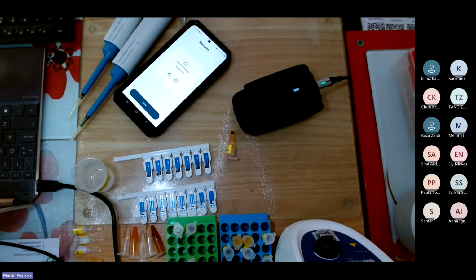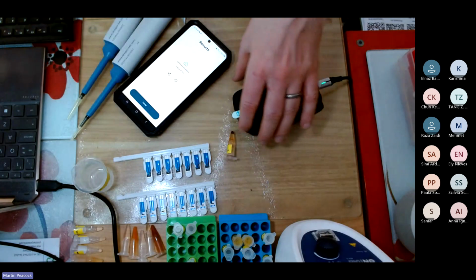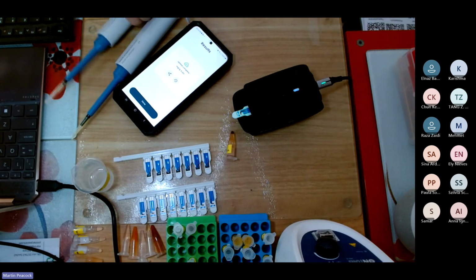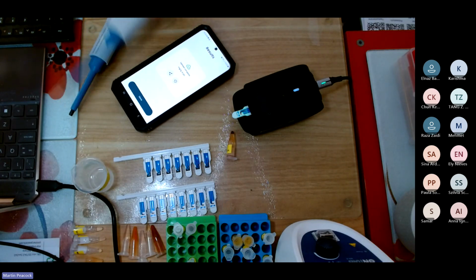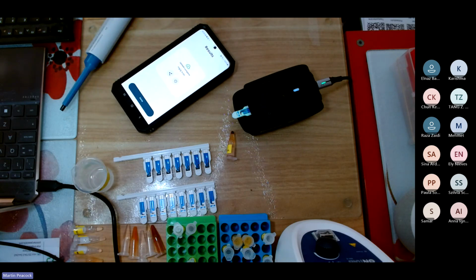You'll see me reuse electrodes quite a lot this afternoon, especially in a teaching kind of environment. In a research environment, you have a lot of things going on an electrode. But in a teaching environment where the electrodes may be only doing one piece of chemistry, like the oxidation and reduction of ferricyanide, you may be able to reuse, I should say, not so much recycle.